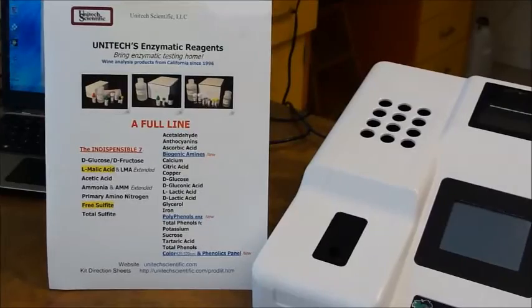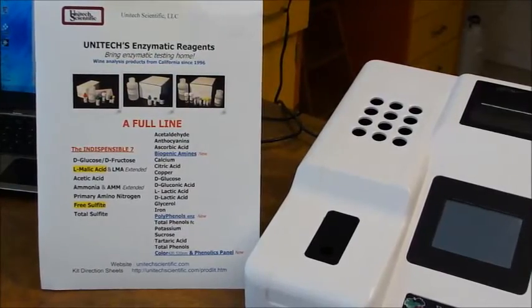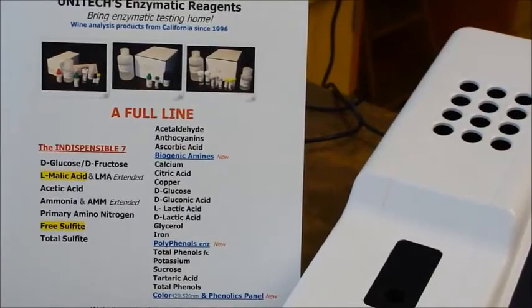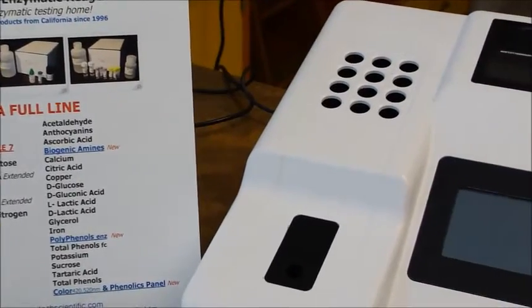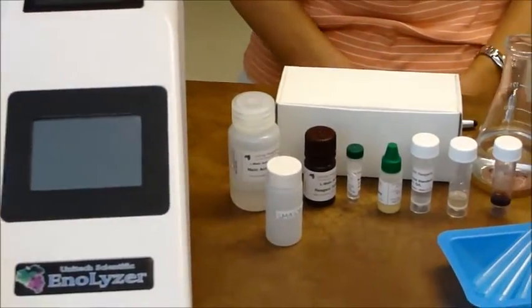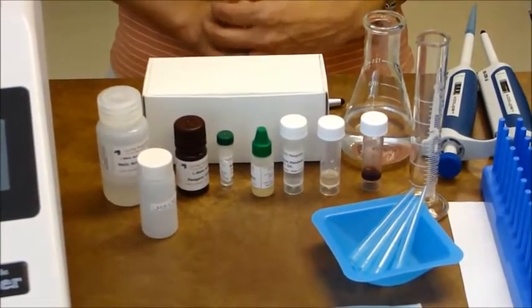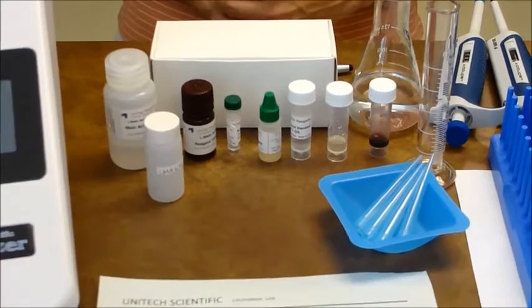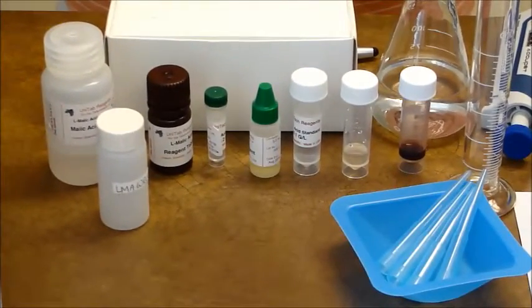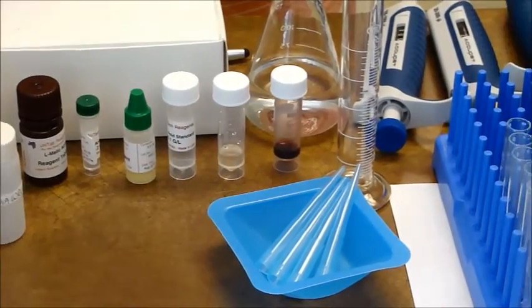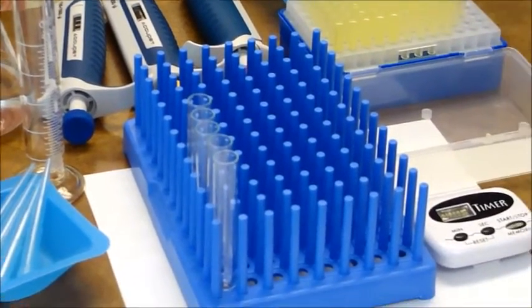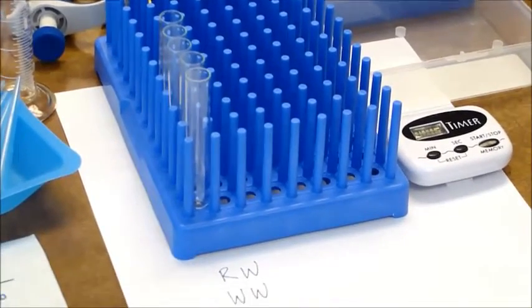The test procedure for malic acid is much like most Unitec enzymatic reagent kits. Our initial reading step records the color of the wine sample and working reagent mixture. After adding the start enzyme, the final reading step records the reaction color. The change in absorbance is used to automatically calculate grams per liter based on the standard result. Enalyzer makes this easy.